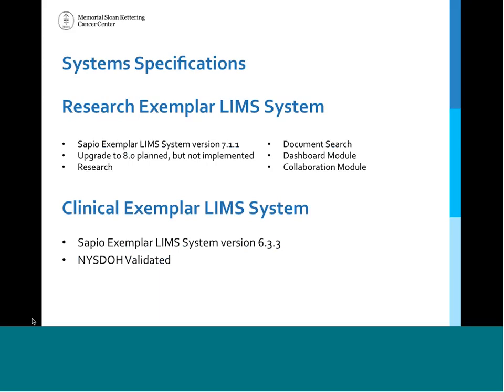So in brief, we have 2 systems here. The research Exemplar LIMS system, we are currently operating on 7.11. We do have plans to upgrade to 8.0. We haven't implemented this yet, but the tablet support feature is a really large driving factor in our decision to upgrade to 8.0. Again, this is just for the research side. We do have the document search enabled. We also have purchased the dashboard module and the collaboration module that we utilize.